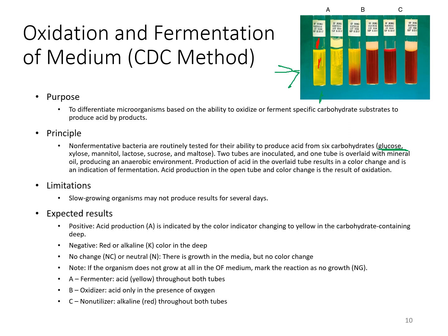Once that organism is placed into that, it is incubated for up to 7 days, and of course you're looking for any sort of production of acid within that tube. So you would do 2 tubes for each particular sugar that you're trying to test for.